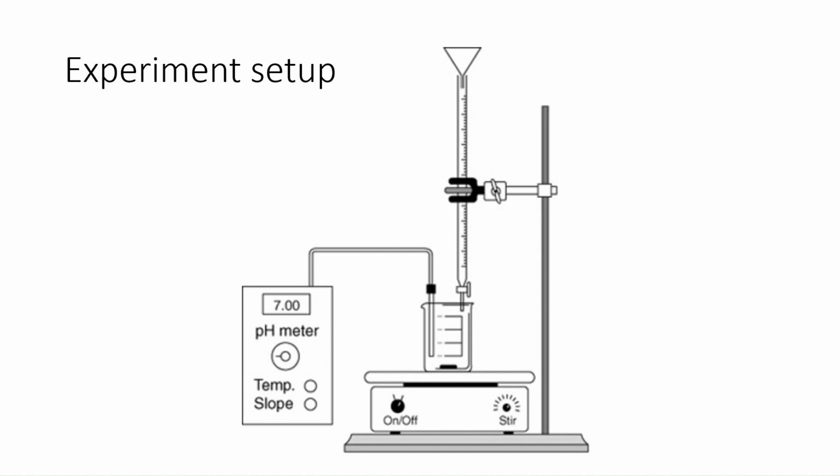And the way you can tell if you're measuring or if it's sort of done reading and stable, is there's a little A drawn on the display of the pH meter that's showing that it's reading. And when it's stable and it stops reading, it will draw a little line over the top of it. So please keep an eye out for that, and if you do see it, it's not a problem. Just make sure you press the read button again before you continue.